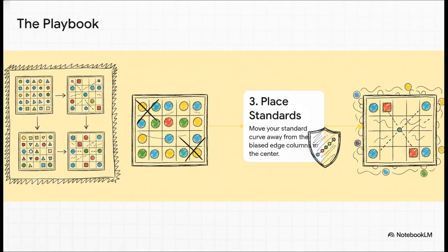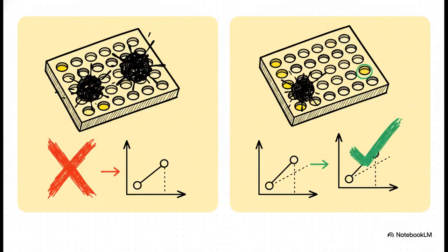And fourth, and this one's huge, interleave your replicates. Let's look a little closer at why that one is such a game changer. Okay, look at this. It just shows you the power of smart design. On the left, that's what most people do, replicates right next to each other in A1 and A2. Well, what happens if a little bubble or a splatter hits that corner? Boom, both of your data points are garbage.